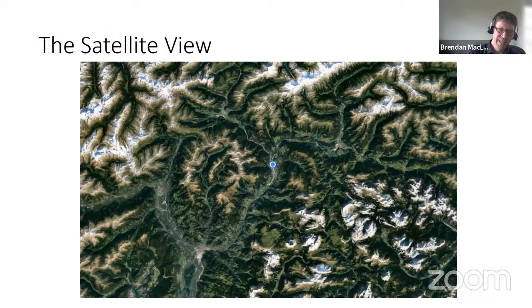So Skyline is organized around this principle of directed investigation. And I like to draw a parallel to Google Maps. This is a satellite view in Google Maps. And as I'll show you, we have a satellite view of our own in proteomics.